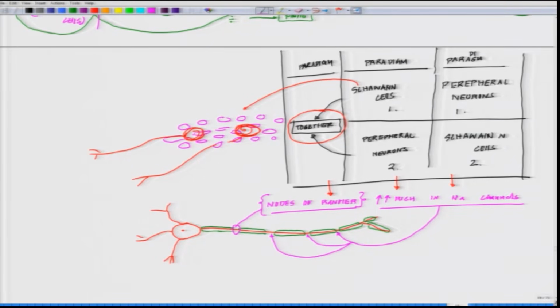You have to stain these cells in culture before you claim that you have done it, with myelin basic protein. We have talked about it, the antibody against myelin basic protein.